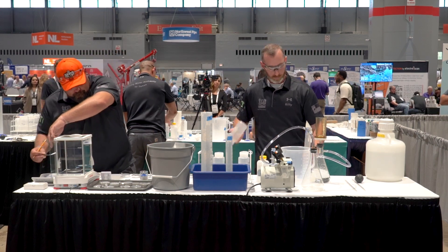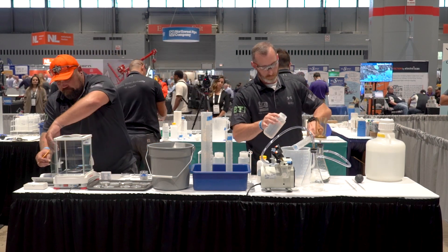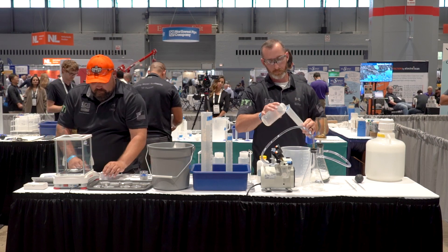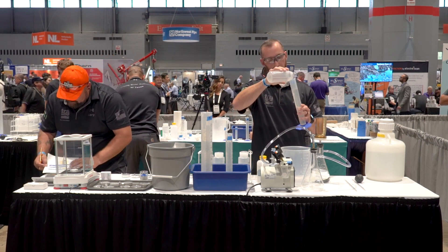Your MA may run it differently, but at WEFTEC we make sure that those boxes are yellow. Follow the yellow brick road — make sure that there are numeric values or names in each of those cells.